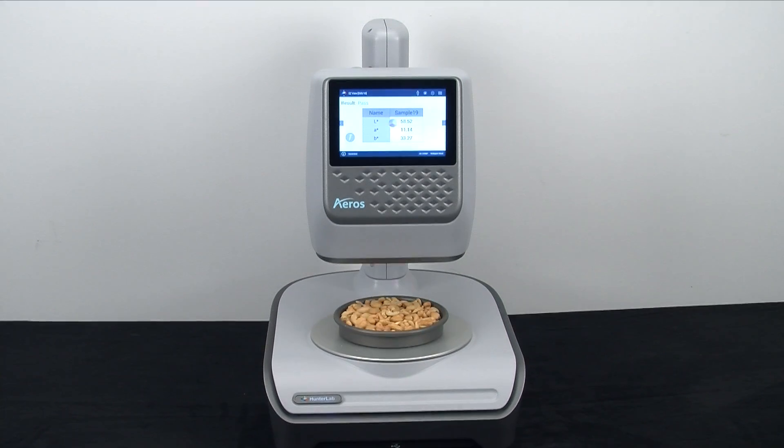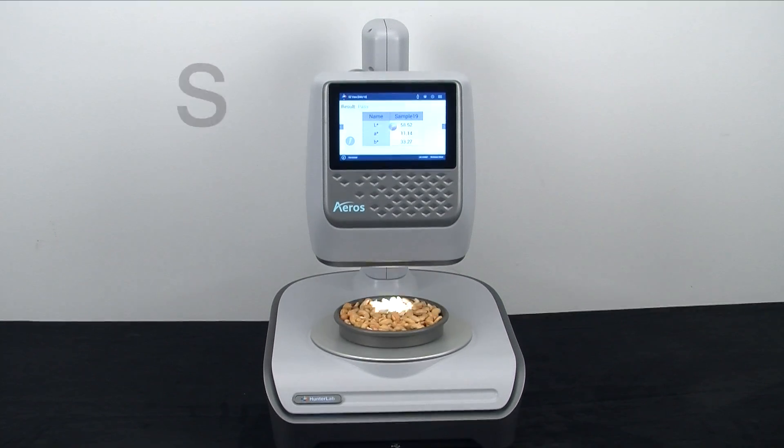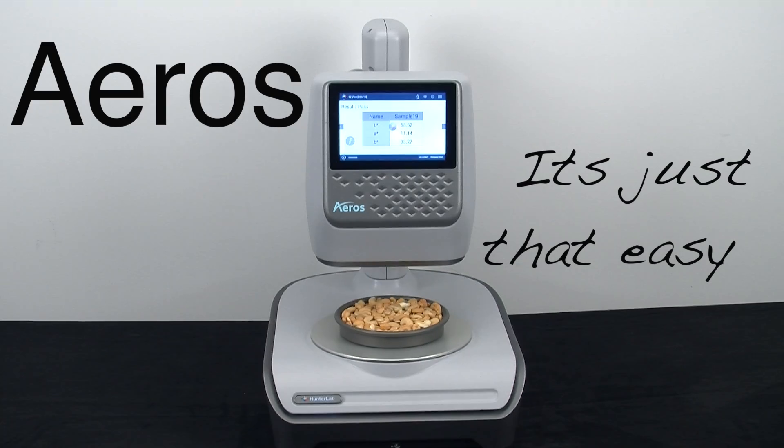From package container to sample tray, Aeros sets new industry standards for ease of use and repeatability of color values. Aeros, it's just that easy.